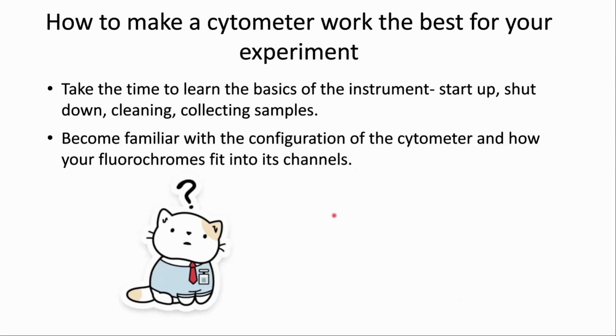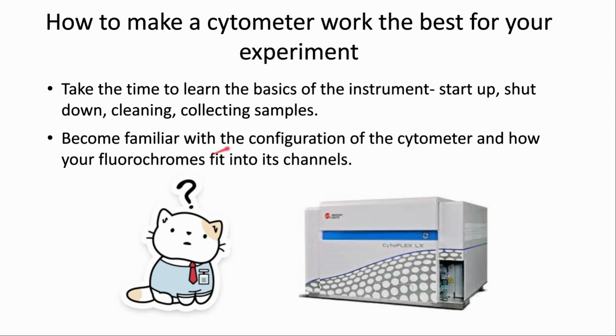In order to make a cytometer work the best for your experiment, we would advise that users take the time to learn the basics of the instrument. This includes the startup, shutdown, cleaning procedure, as well as basics for creating an experiment, collecting their samples, and then collecting their data. By becoming familiar with the configuration of the cytometer, you would understand which fluorochromes fit into the channels and how large your panel can be, and then still work on the instrument.